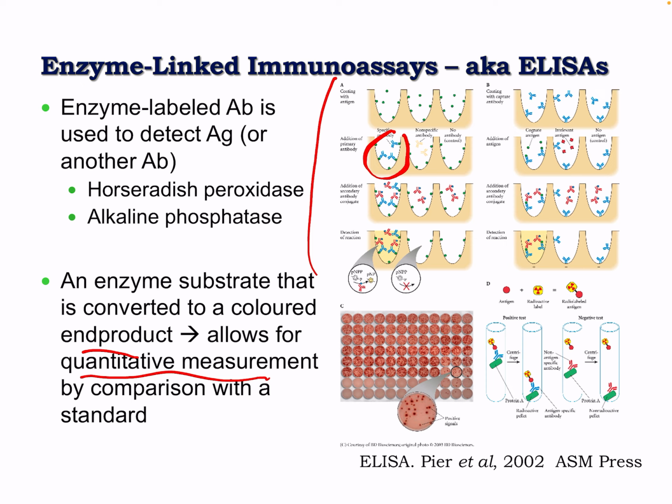Sorry, I got it backwards. So we put our blood in, or our saliva. At least from my experience, those are two mediums I've used. Our antigens will be in there. Then we add the antibody from the product. These antibodies are made specifically to bind to, in this case, IL-8, and there's a ton for different cytokines. Let's just say we also have IL-6 in the blood. These antibodies won't bind to IL-6. They'll wash away, but they'll bind to IL-8 as we intended.